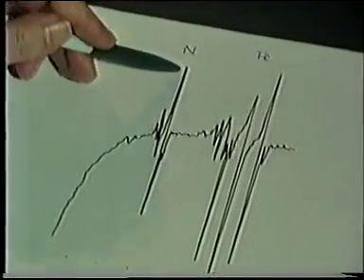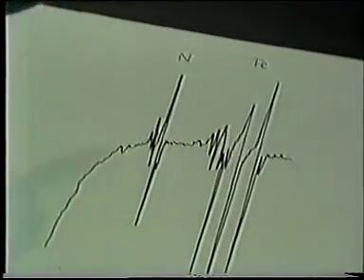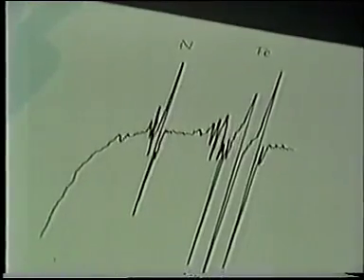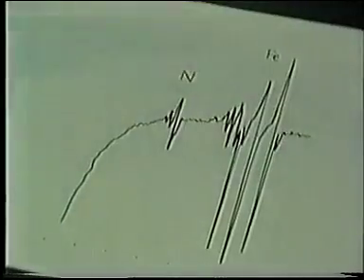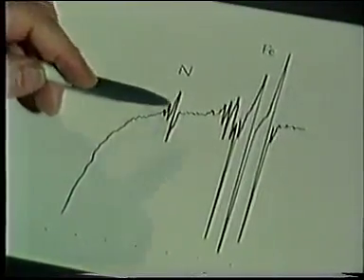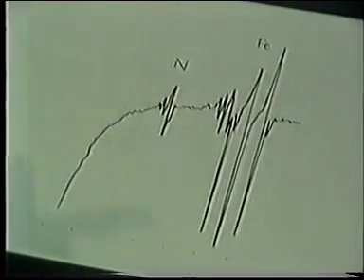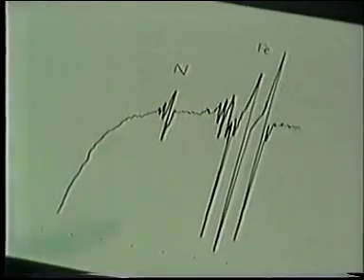First of all, the spectrum from the nitrogen-saturated surface, and you see that the signal from the nitrogen is comparable in magnitude to that of this iron signal. If we now do the same experiment with a surface which was exposed to a reaction mixture, we get a spectrum as shown here. And the relative intensity of the nitrogen signal is now much smaller, so we know for certain that the concentration of the nitrogen is far below saturation.